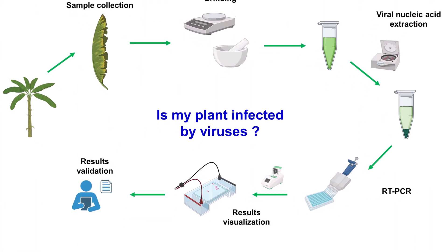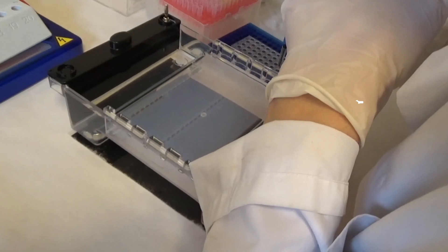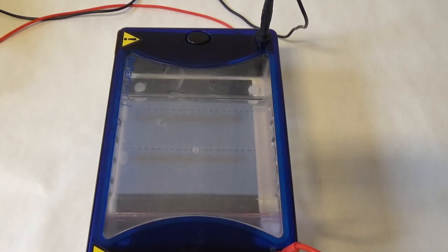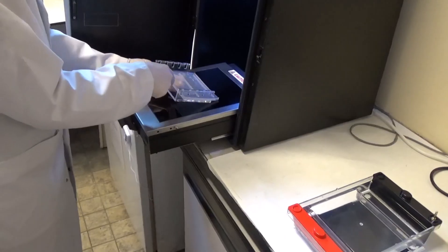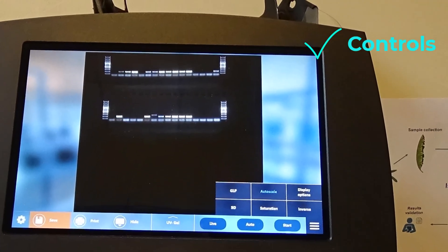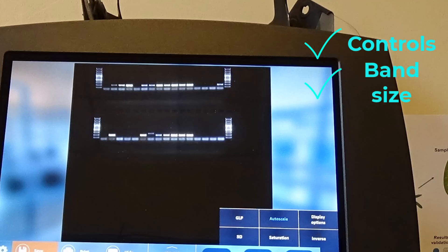The last step performed in the lab is the results visualization. After running the PCR, the amplicons produced are migrated on an electrophoresis gel and then visualized in the dedicated gel dock. First, positive and negative controls are verified for the presence and absence of bands respectively to validate the test. Then, the samples tested are inspected for any presence of bands at the expected size, which will indicate positive results.